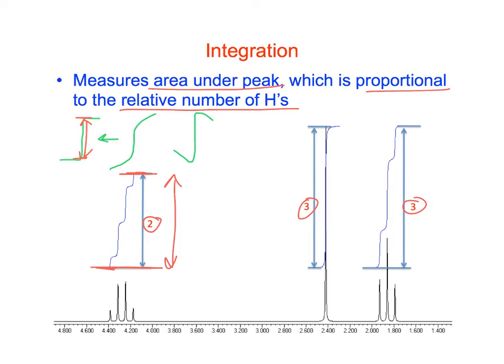So when you're doing it, you're setting up the integration lines. You are usually telling the instrument where to start and where to stop, right? But notice if this is how the integration looked, would this give a correct integration? No, this would give an integration that's too big, because you really want to start at the inflection point here and go to here. Or what about this other one?